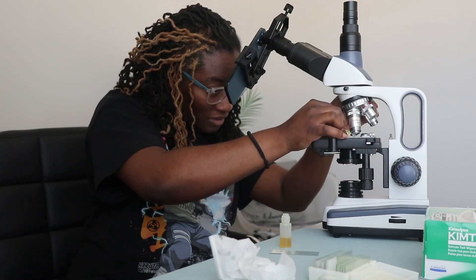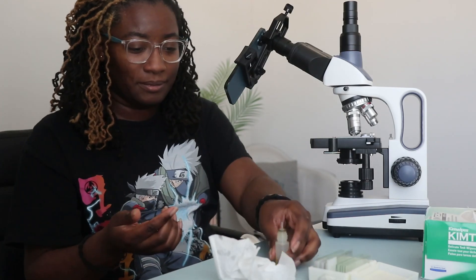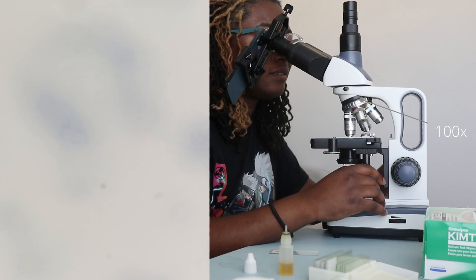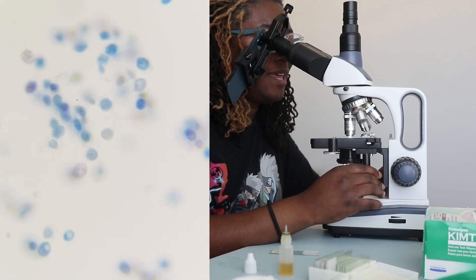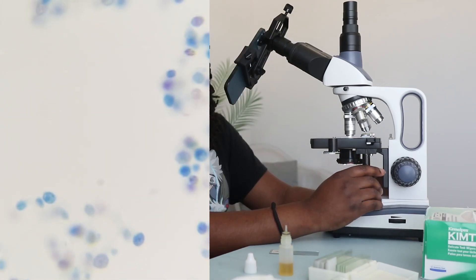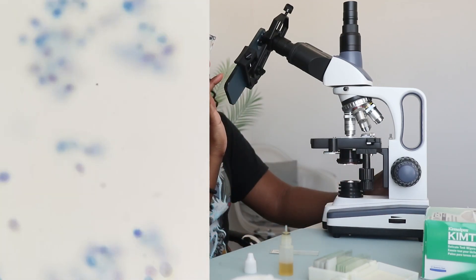I'm just going to put a little tiny drop. Okay, so this is 100x. Turn the light up and you can see the different cells. This is 100x — the brightest it'll go. And I'll snap a picture.